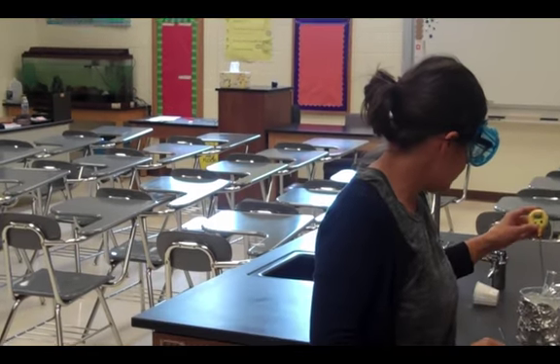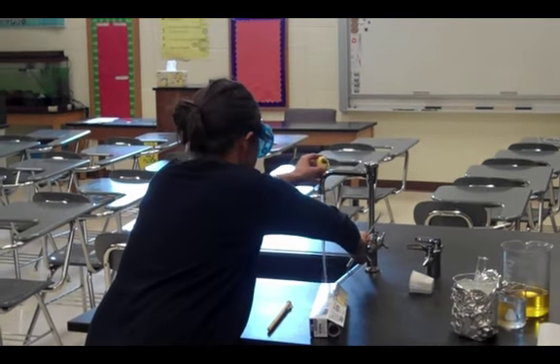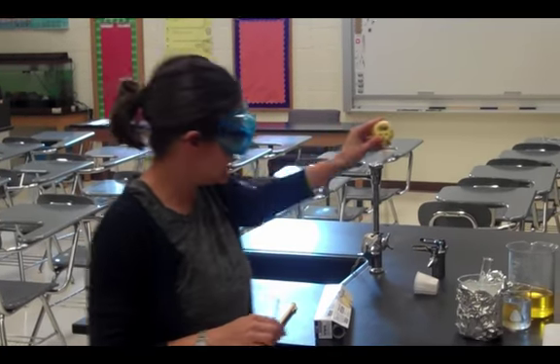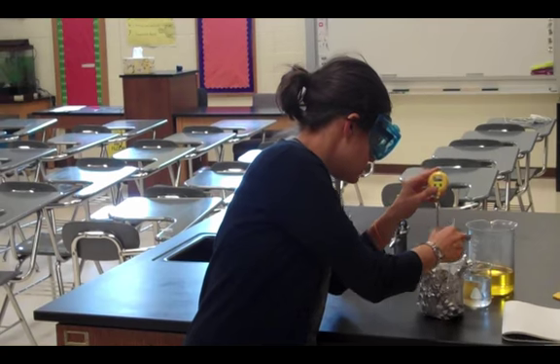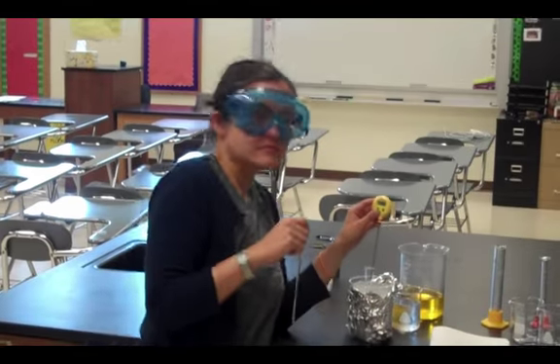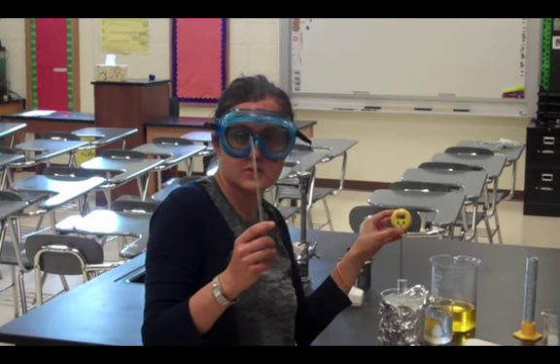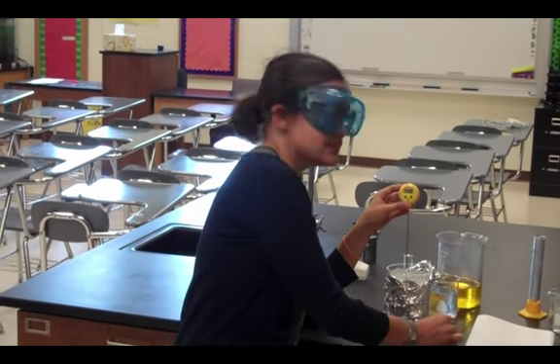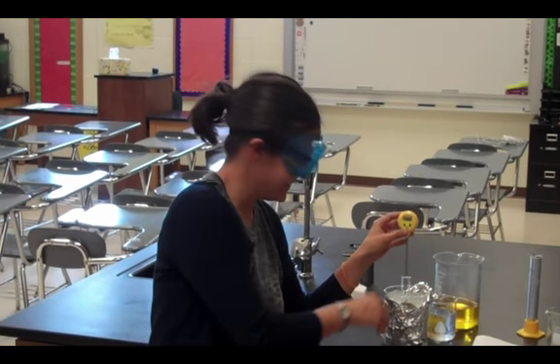Place the thermometer now in, rinse your thermometer, place your thermometer in the test tube with water. And if you're working with a partner, you could have one person hold the thermometer and the other person stir with the clean stirring rod, but since I'm working by myself today, I'll just stir with the thermometer.